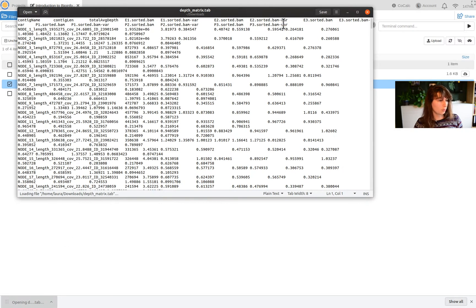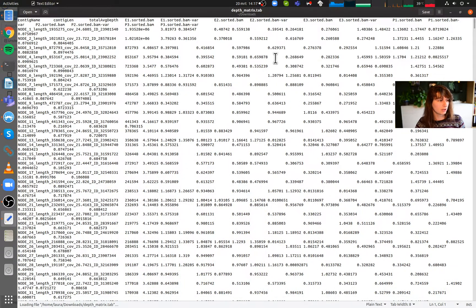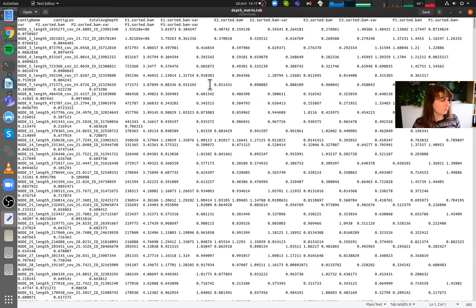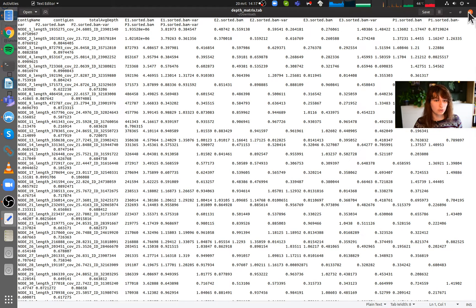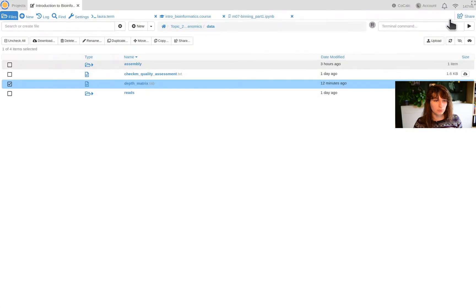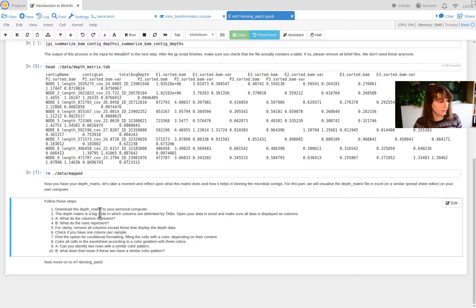So I will just open it. I'm on a Linux system here, so perhaps it looks a bit different than what you're used to. Still very hard to read, so I'll close this down again and go back to the instructions.